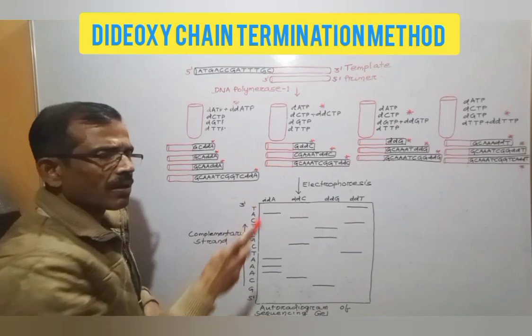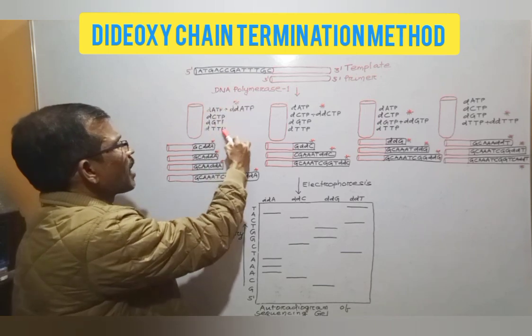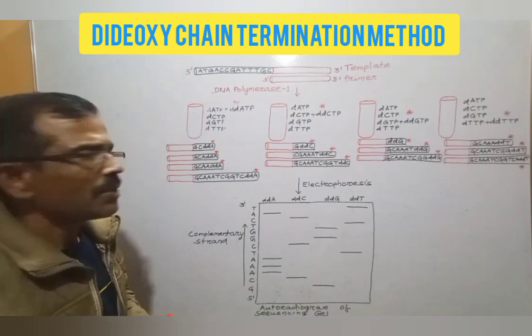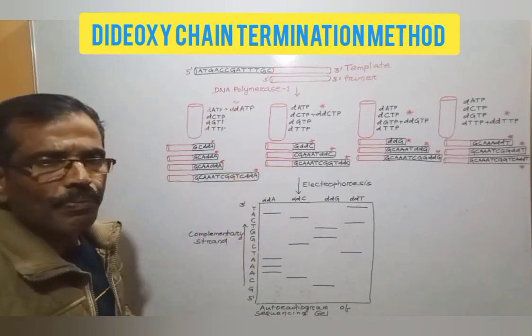In batch 1, the reaction mixture contains 4 types of deoxyribonucleoside triphosphate plus dideoxyadenosine triphosphate. Dideoxyadenosine triphosphate does not have a hydroxyl group on the 3rd carbon.